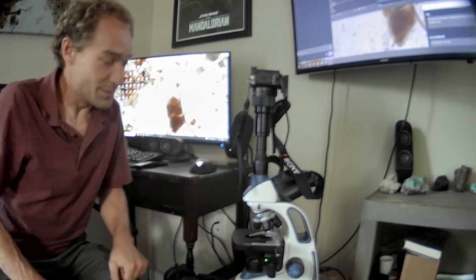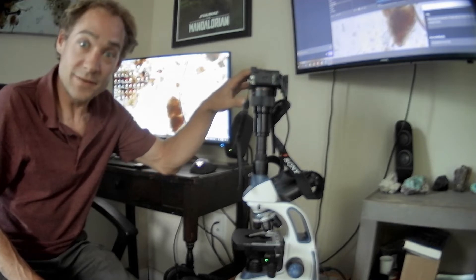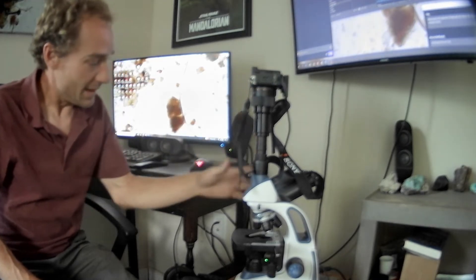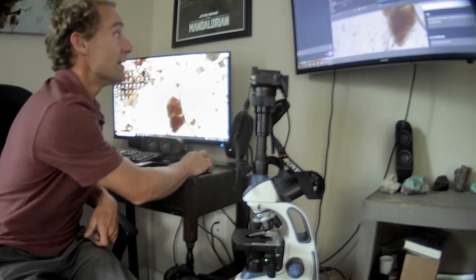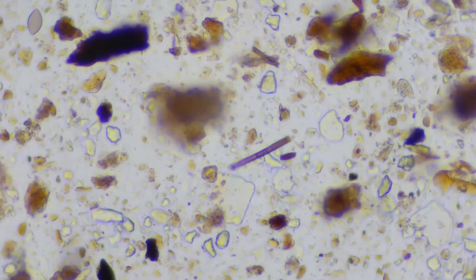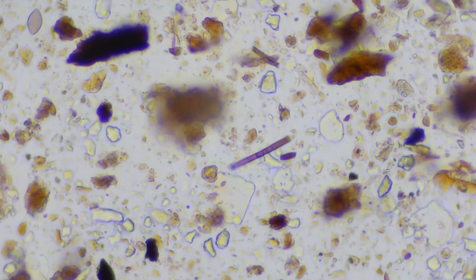All right, we're up here in the lab slash studio — aka my bedroom — and this is what we're going to see: a full frame camera DSLR hooked up to a Swift 380T microscope. This is what we can see through it — this is a sample from my garden.